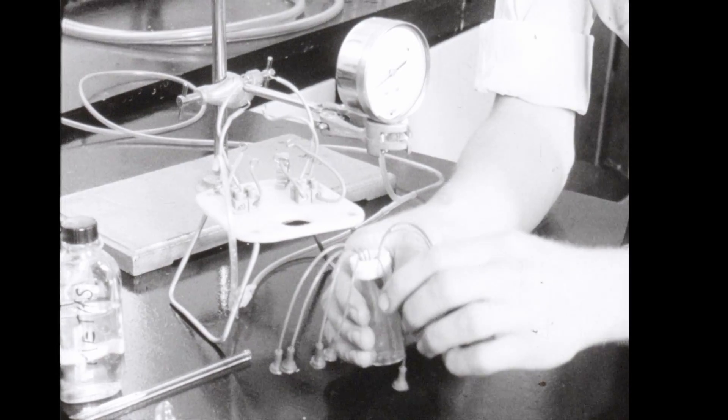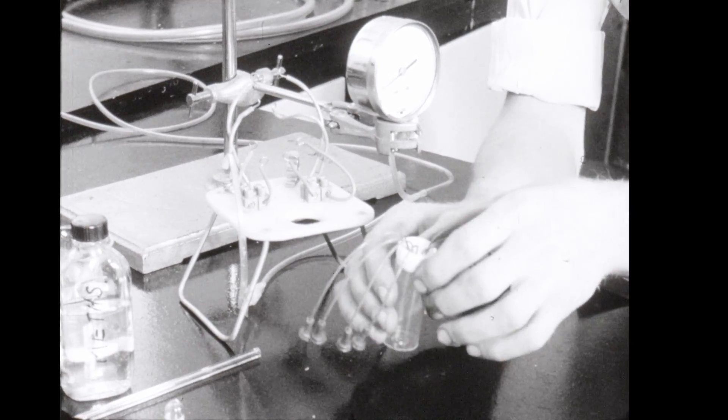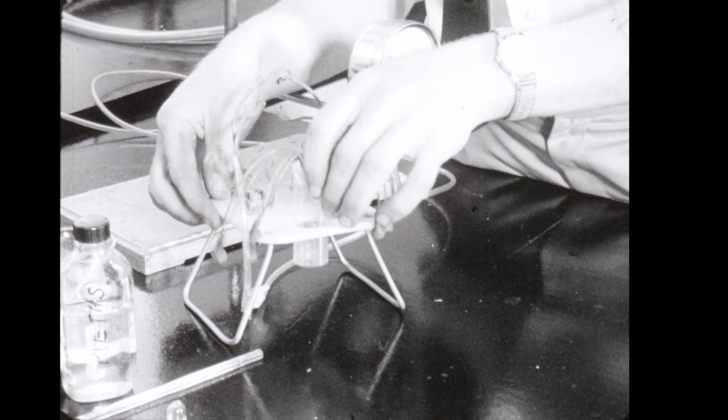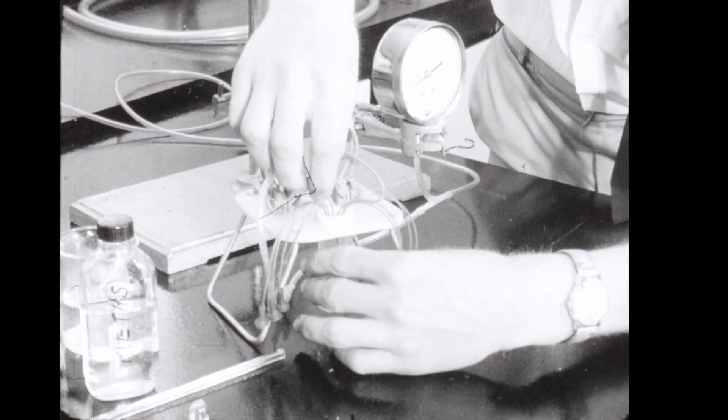The mouse milking machine at Werribee was developed by Research Officer Graham Mean for display at the farm's open day. It's similar to machines used by the National Cancer Institute.